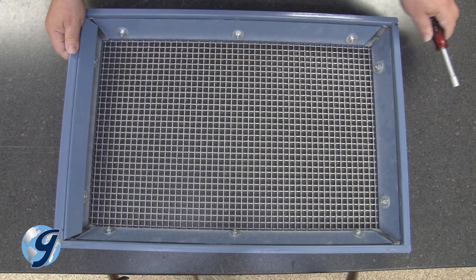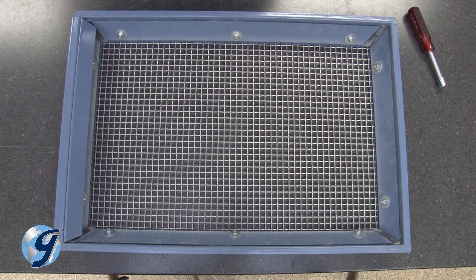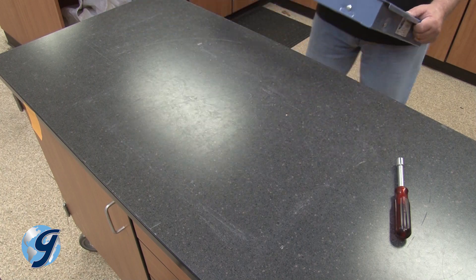During this process, double check to ensure the wire cloth is centered within the screen tray. Once the wire cloth is secured, the screen tray is now operational.